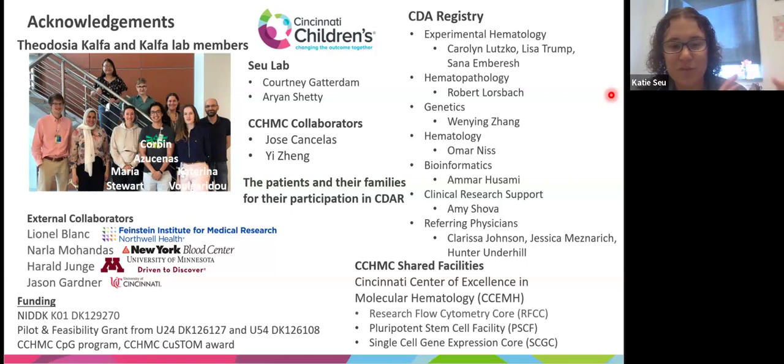I think that was in the paper. The macrophages just look different, and they did have some differences in markers, specifically between the spleen and the fetal liver. Also, we don't see CD11b positive cells, which I think is expected, since you don't see a lot of myelopoiesis in those organs.